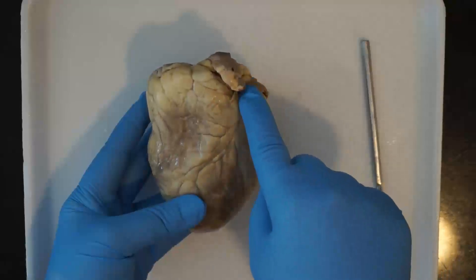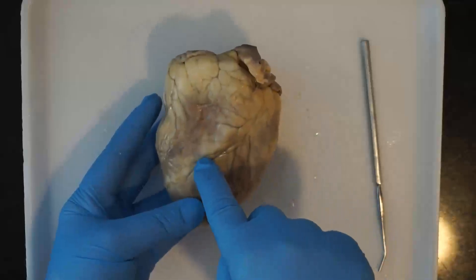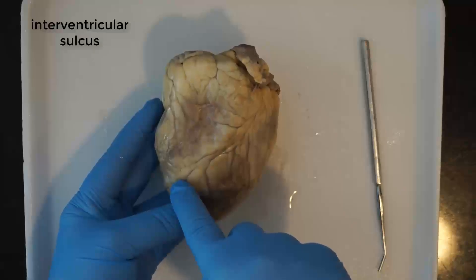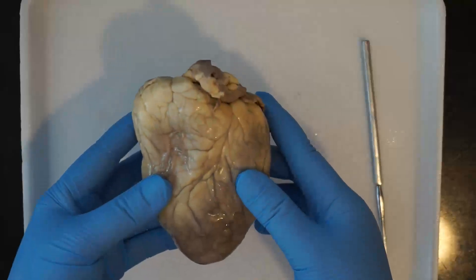Down the center of the front of your heart you'll see the interventricular sulcus. That is a ridge that divides the two ventricles of the heart, which you'll be able to see a little closer later.